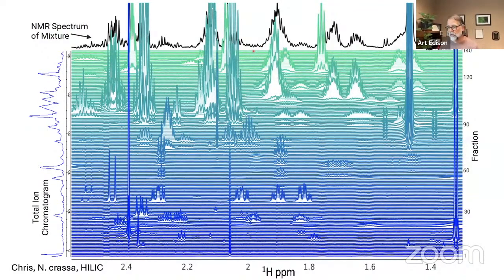We oftentimes boast about the fact that we don't need much in the way of sample preparation, in contrast to what LC-MS needs to do for sample preparation. But I think it's to our peril that we're not doing more chromatography and cleaning things up. It's not to say that we can't separate this information. We can do 2D NMR and start to resolve some of these things, and people do that. So it's not like we're totally missing all of this, but if you look at 1D NMR, you have to realize what the complexity is underneath that.